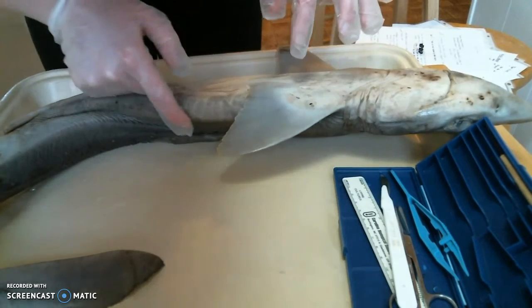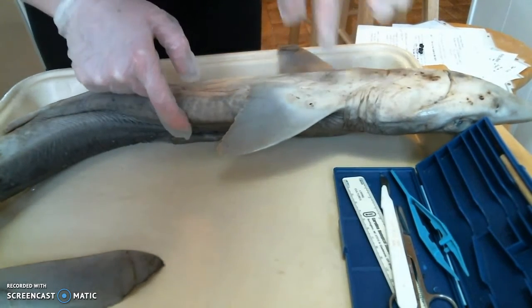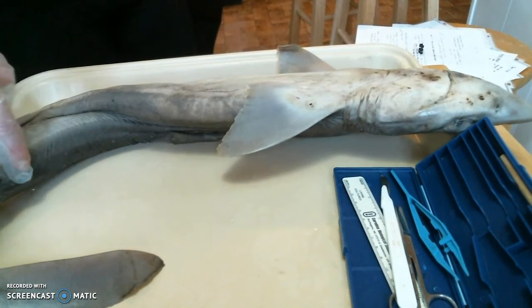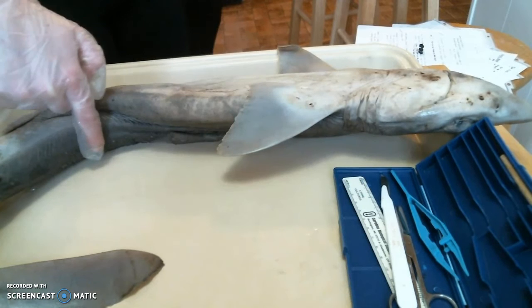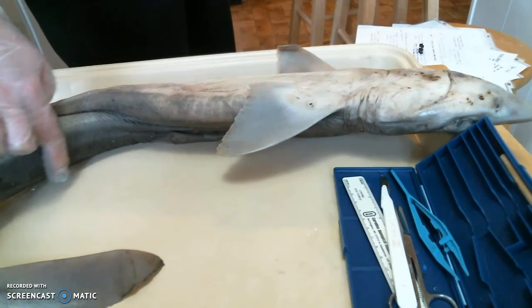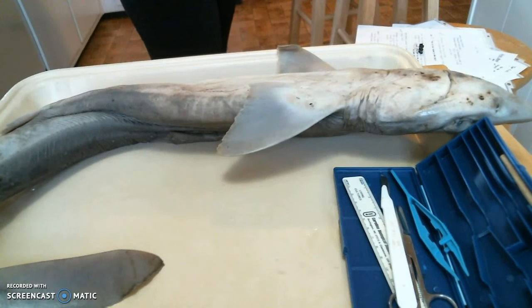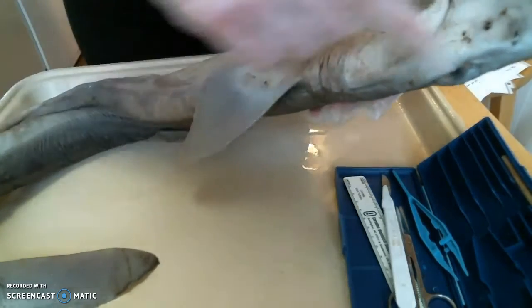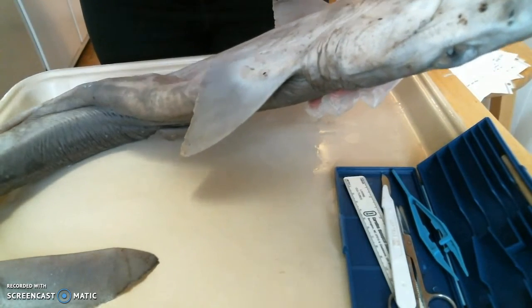I don't really notice anything all that interesting about the skin. It doesn't feel as rough as some things. I guess if you rub against the grain, you can kind of feel a rough sandpaper texture a little bit. It's not as distinct as I thought it would be. They told us to look at the snout, so you can see the nostrils there.